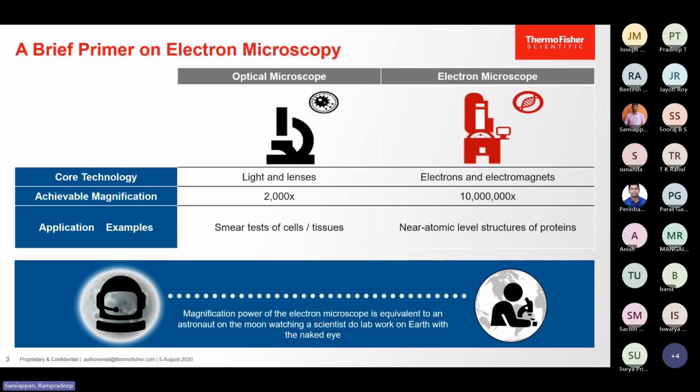A short introduction about microscopes and microscopy. Previously, during our schooling, we used the optical microscope, which mainly has basic lenses, and the magnification is small. We have done several experiments to examine cells and tissue samples. But now the difference between the optical and electron microscope is, obviously from the name, it shoots electrons from the electron gun.